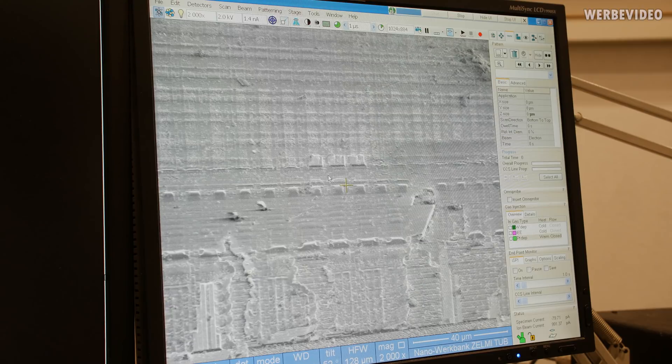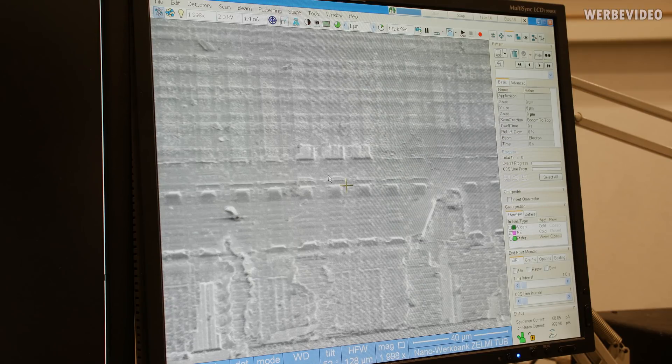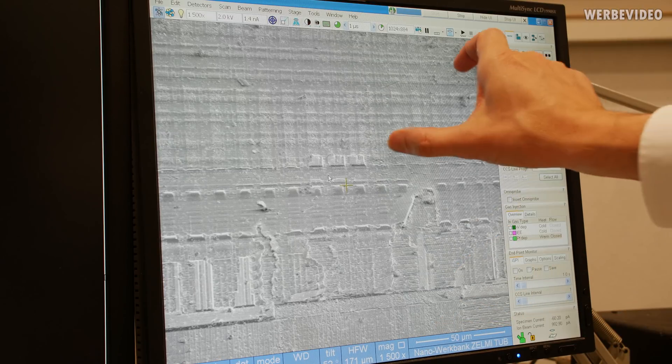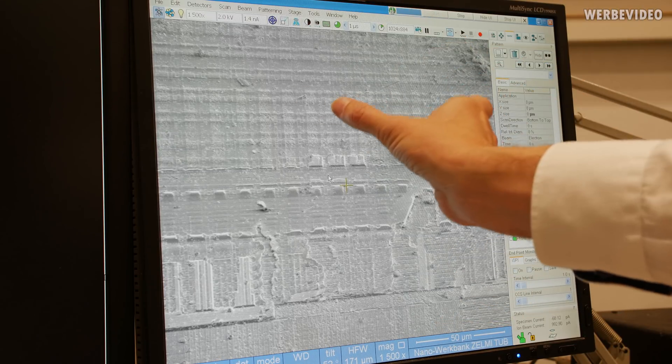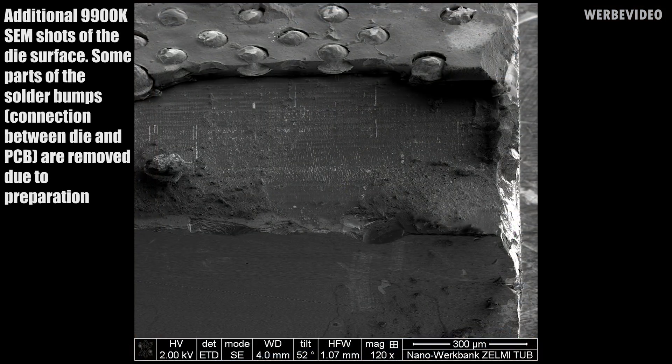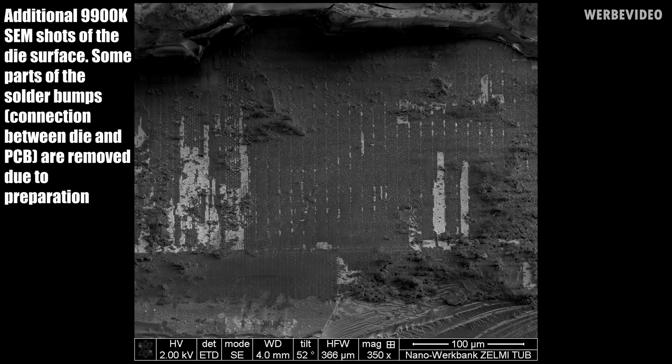So I now increase the magnification and you can easily see our structures. Now I go a little bit back. This is about the size of the human hair here, but these semiconductor structures are a lot smaller. But again, this structure is a top view, so we cannot see it from the side. And to see it from the side for a TEM, we have to perform the cut first.